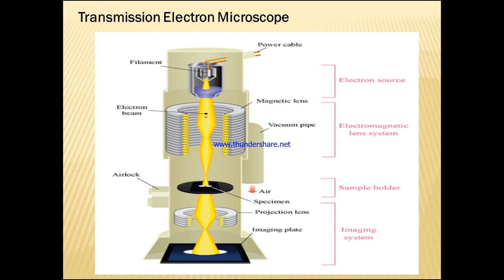In SEM analysis, that is the scanning electron microscope, we go only for analysis of the surface and composition of the material; the electron beam does not pass through the sample. Here, the electron beam passes through the sample. Because of this, samples of less than 100 nanometer thickness, prepared using an ultramicrotome, that is thin materials, can be analyzed using the transmission electron microscope.